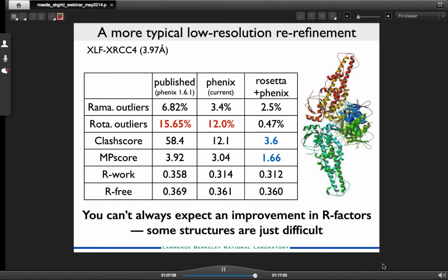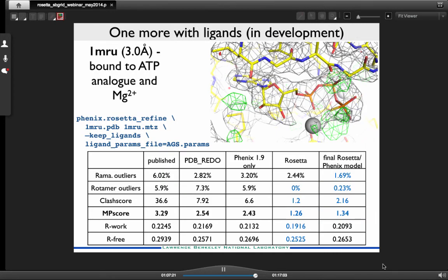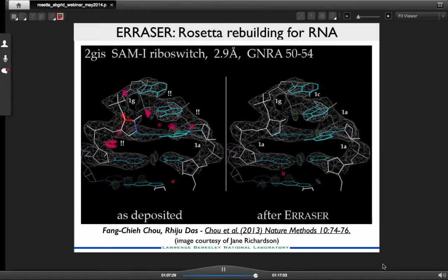But the important thing here is that I actually left the ligand in for a change. You can see there's some difference density, so it's not quite where it needs to be. But this was just run on Friday. This is not actually in the release version yet, but hopefully in the next few weeks we'll have this working a little bit more robustly. But at least it's ended up being fairly straightforward to add in support for ligands.